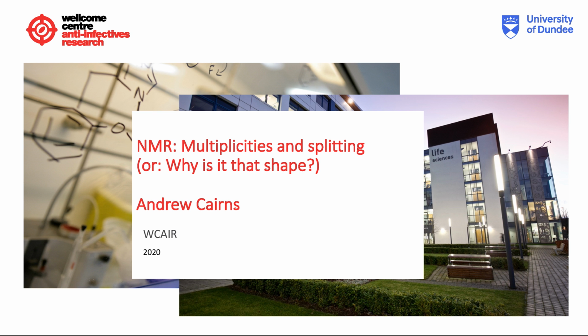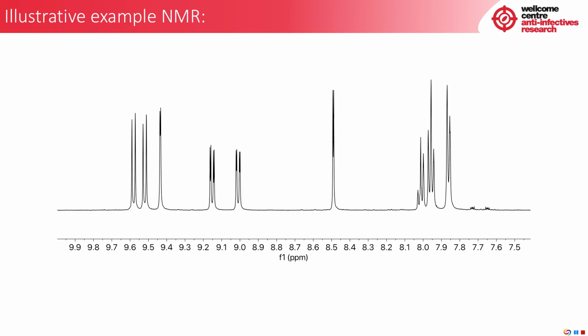Welcome to an NMR tutorial on NMR multiplicities and splitting, or why is the signal that shape? Just to outline what we're going to talk about, I'm not going to talk about chemical shifts. I believe you're already familiar with that. Instead, I'm going to focus on splitting patterns.